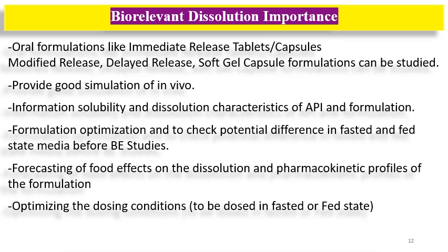Then biorelevant dissolution importance. See, we cannot do the biorelevant dissolution testing or testing condition as QC release testing condition. Then what is the importance? So with biorelevant dissolution, formulations like immediate release, modified release, delayed release formulation can be tested during the optimization stage or to have the understanding of in vivo behavior of the formulation.